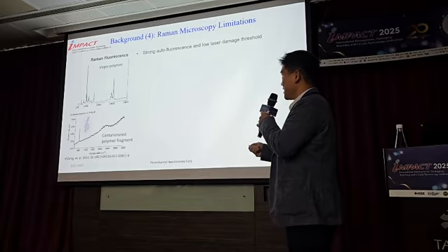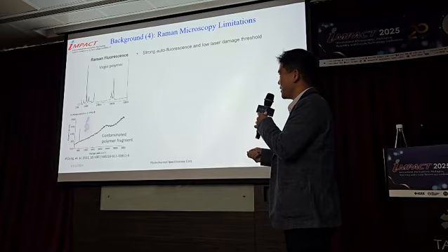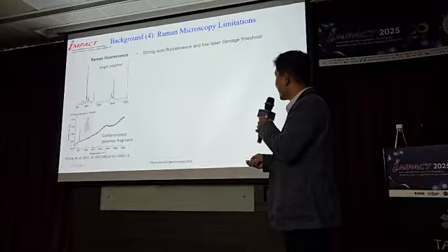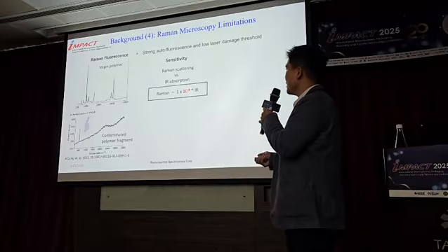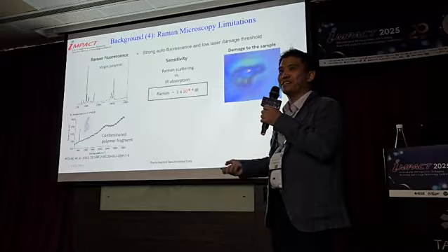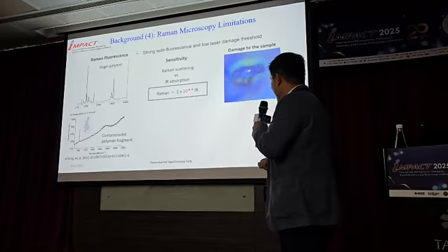It is quite easy to get a Raman spectrum when we have the material pure, but as soon as it is contaminated with or has a color master batch of some sort, then the fluorescent baseline is going to be quite strong. Naturally, Raman is 8 orders less sensitive than IR, so oftentimes we face a situation where, when we try to get more signal, we burn the sample. Oftentimes that's what I see. A customer gives a sample to me, I only see these holes on the surface.